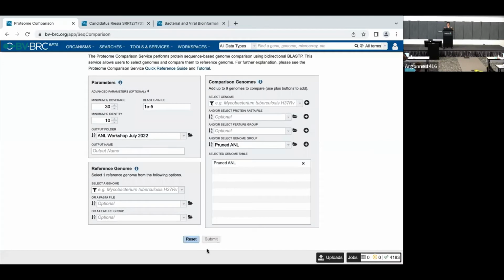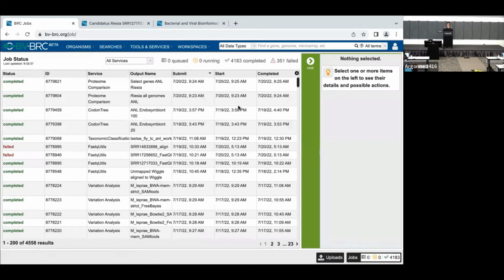Okay, but for those of you who can submit that job, go ahead and do that. And we'll look to see if any of the previous jobs submitted. And if not, there seems to be a bug that's preventing this, I imagine, and they're trying to figure out what it is. So some of you were lucky and the bug didn't attack you, and some of you were like me, unlucky. So you can click on the jobs. Mine have already completed. That's another good thing about this service, it's really lightning fast. Well, okay, it's not lightning fast, but it's pretty fast.